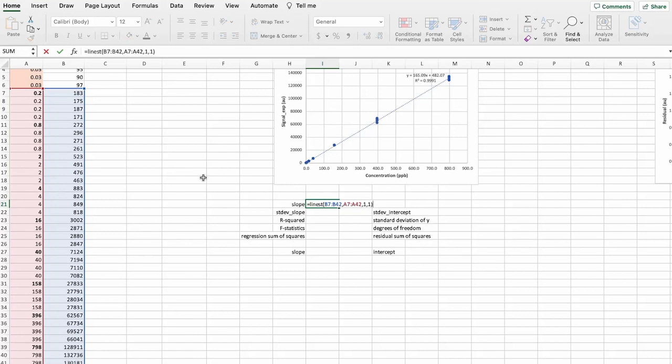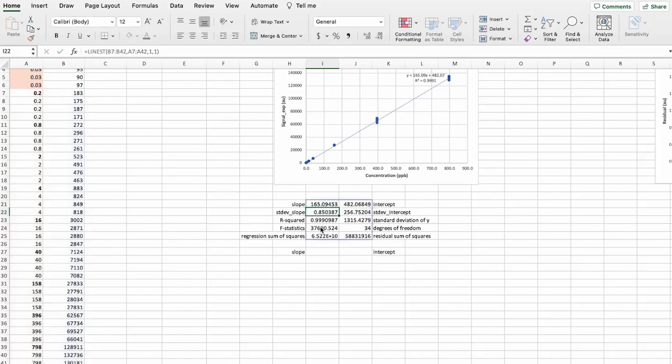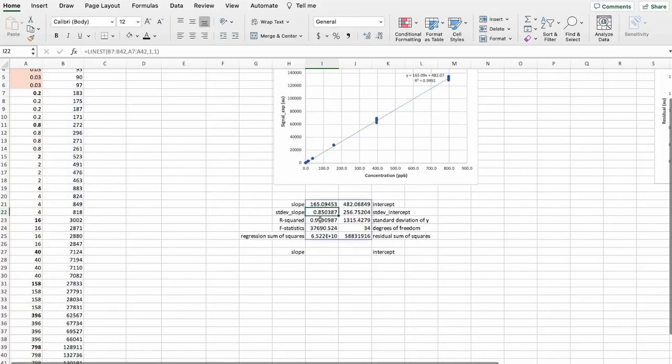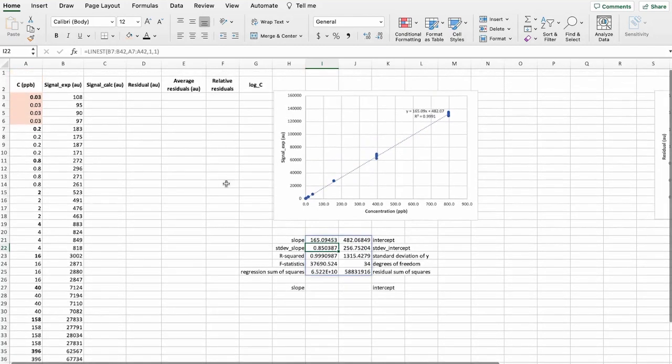And what we will do here in this LINEST function is that we will not force it through zero. So we'll keep it one and one because the zero would force it through the zero. But we don't want that. So now we have obtained the slope and the intercept.